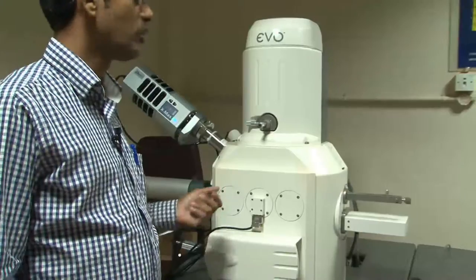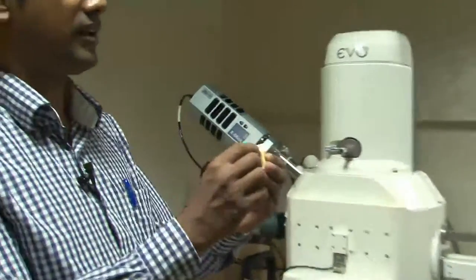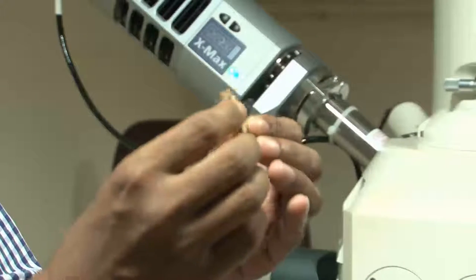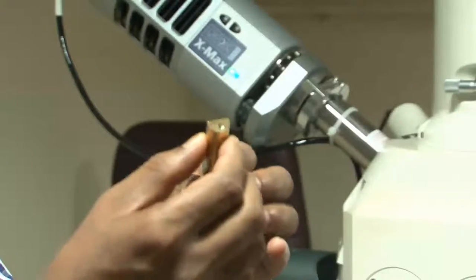And after you load the sample, it is basically loaded onto this kind of holder where you can see there is automatic tilt. So you don't need to tilt it. Nowadays this kind of holders are available. So the sample will remain tilted in this position at about 65 to 75 degrees.